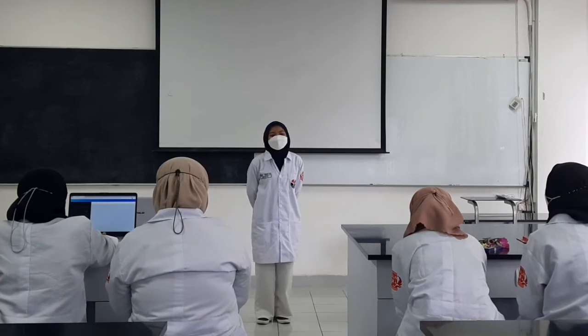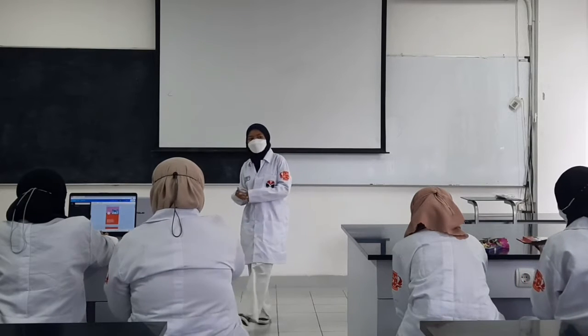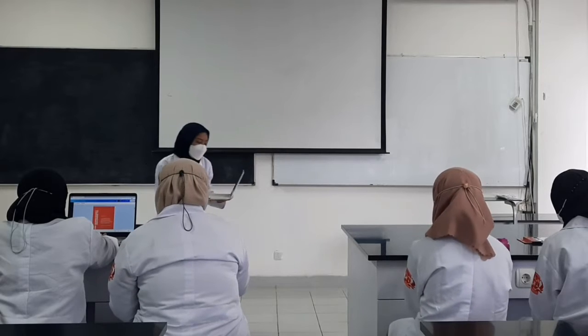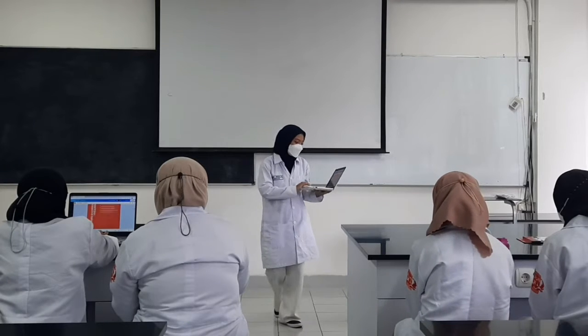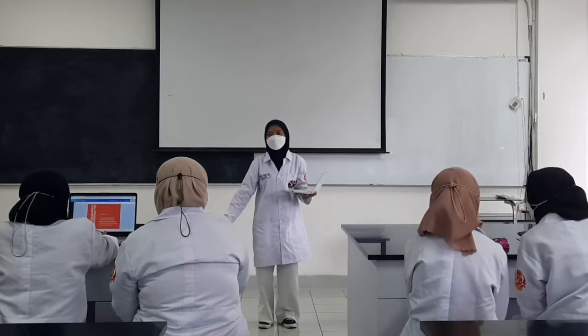So today we will do a simple experiment. It's about homogeneous and heterogeneous mixtures. The objectives for this experiment: I hope after conducting it, you can mention which are the solute and the solvent from the mixture, and you are able to explain the difference between homogeneous and heterogeneous mixtures.